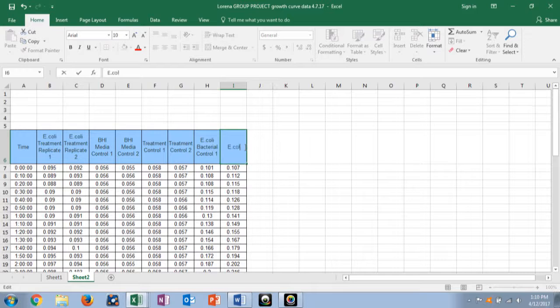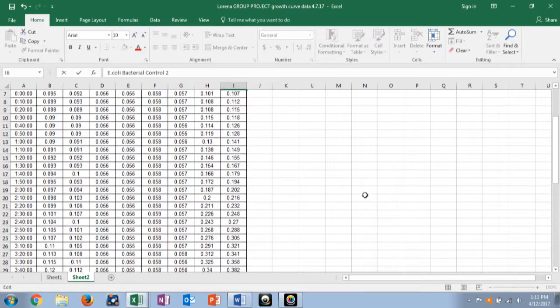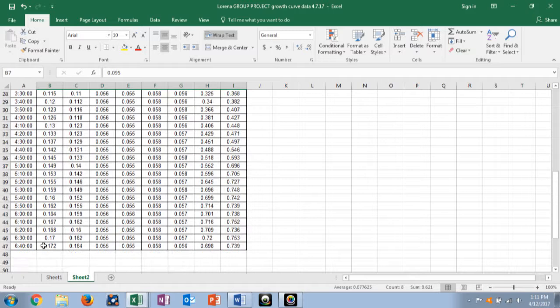And what you're doing, essentially, you're not comparing absolute optical density. Because if you were, you would just take the optical density at the endpoint and then not worry about any of this other stuff. What you're going to worry about is the change in optical density overall. As we can see here, these are our initial optical densities. I'm going to highlight these. We go from 0.0 whatevers all the way up to 0.739. That's a pretty high optical density, actually.